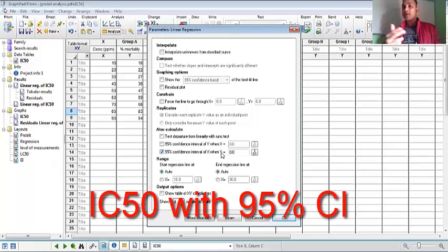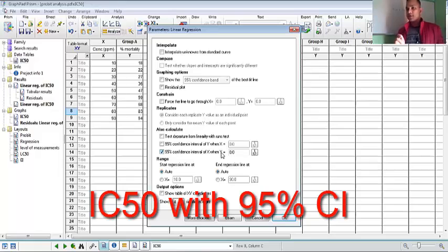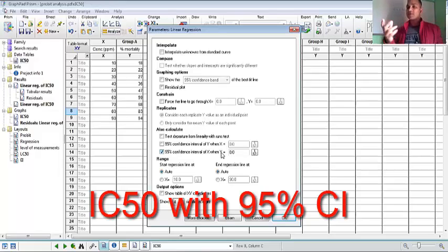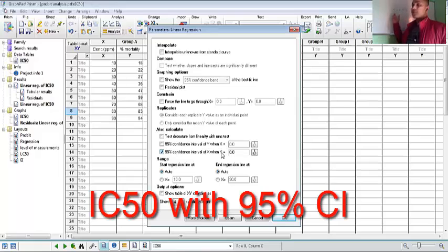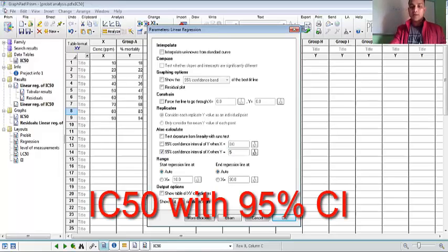That means Y here is 50. If you want to calculate IC50, so Y is 50. Y is 60 if you want to calculate IC60. So if you want IC90, here the Y is IC90. For IC50 we write here 50.